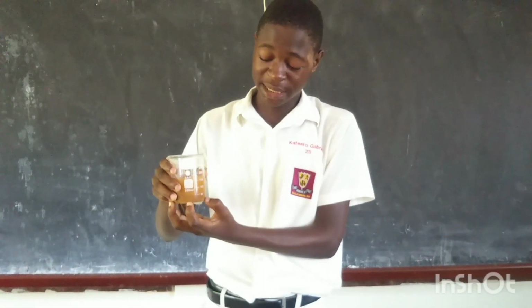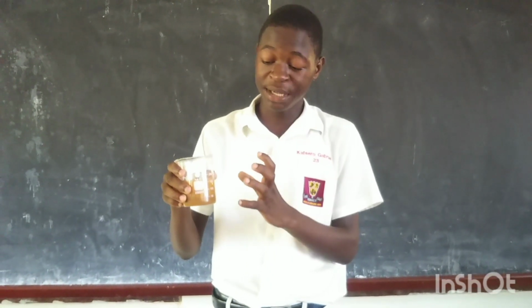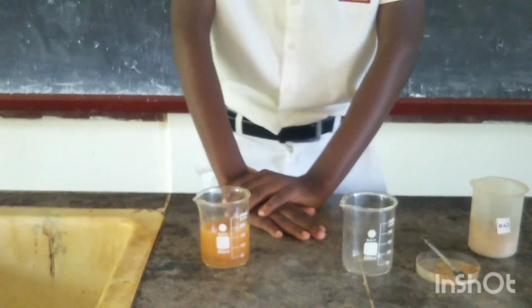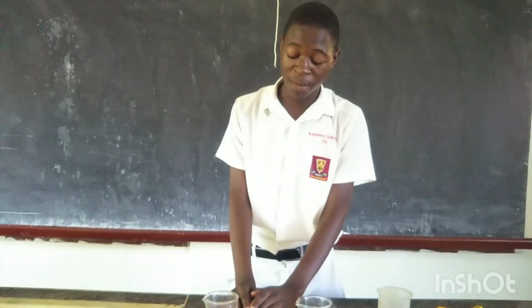If this sand wasn't heavier than water, or if it wasn't denser than water, it would have been on top, or it would have mixed with this water permanently. But as you see, it is not mixed permanently. The sand is just at the bottom of the water, and the color of the water has changed. That's one observation. The next observation is that the sand particles stay at the bottom of the beaker.